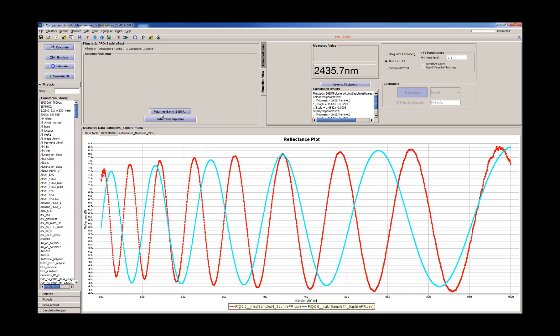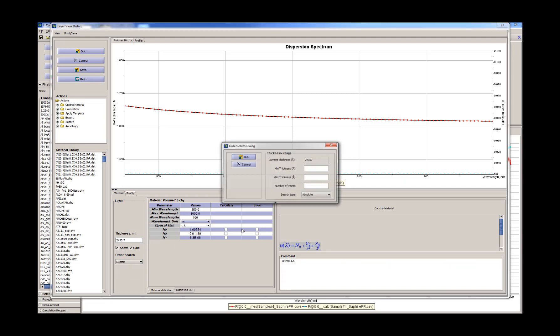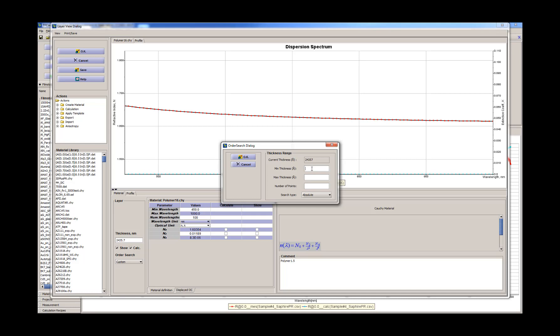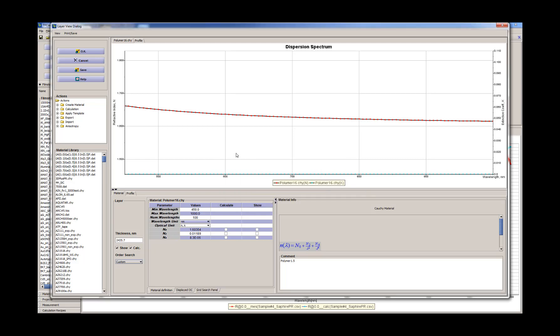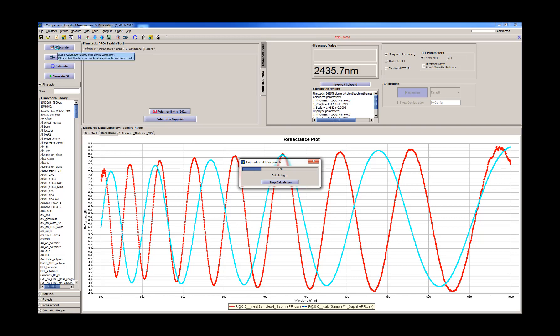Or we can put here order search so that we can measure both thinner and thicker photoresist. So we need to have something like 1.2 micron and let's say 3 micron, and let's say we have 20 points in the grid.